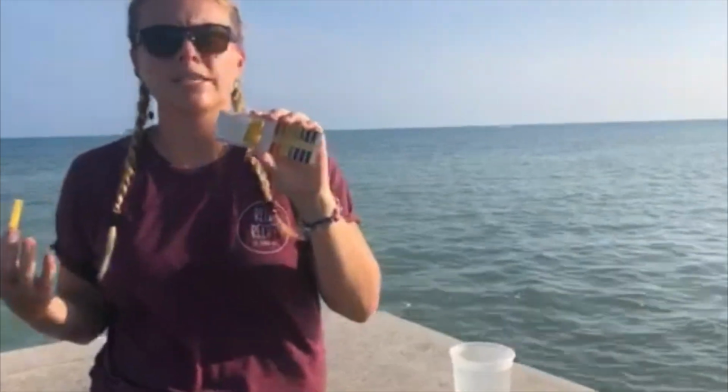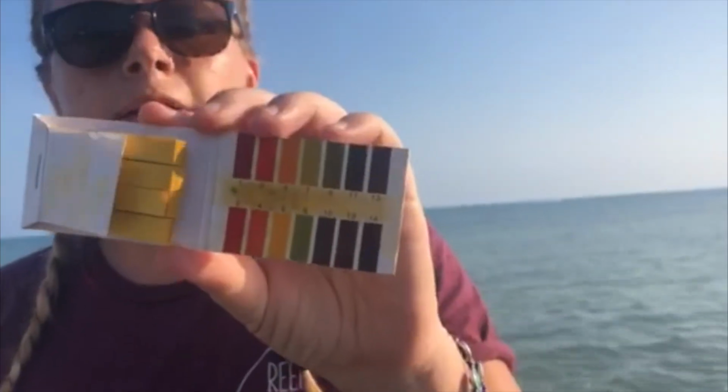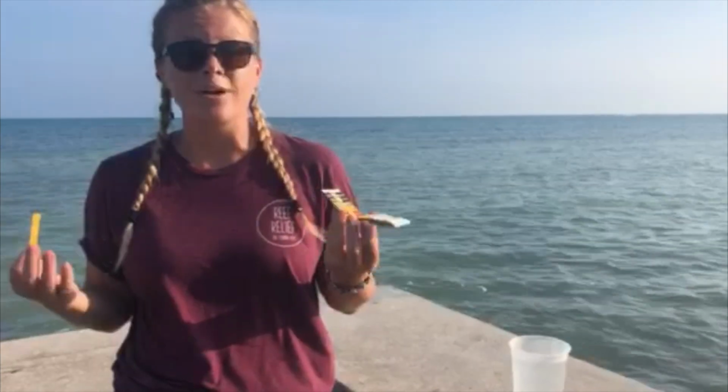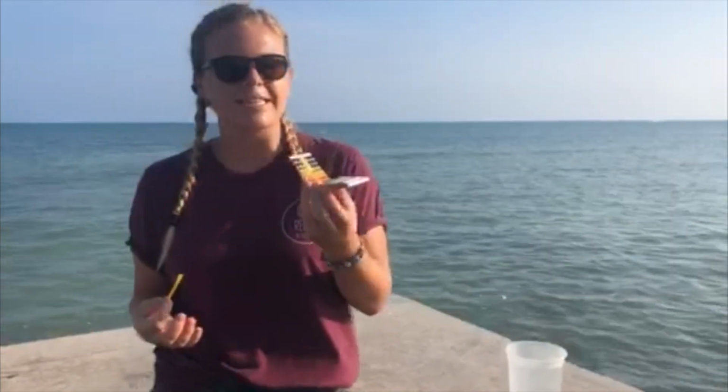All right, so next up, we are going to be testing pH. This you can actually get at any water testing store, pool store, aquarium store, anything of that sort, because it's what people use in their daily lives to test the pH of their pool or of different aquariums. So it's a really cheap thing, and if you're ever bored and you want to see what the pH of the ocean or the lake or the pond by your house is, you can definitely get these. They're very accessible and, like I said, very cheap.